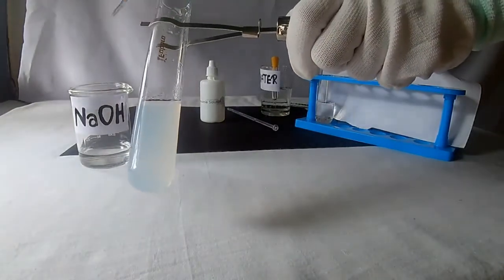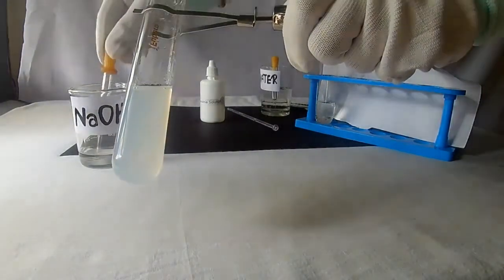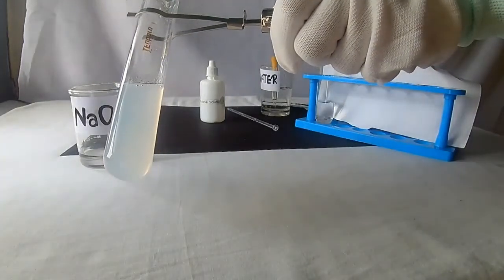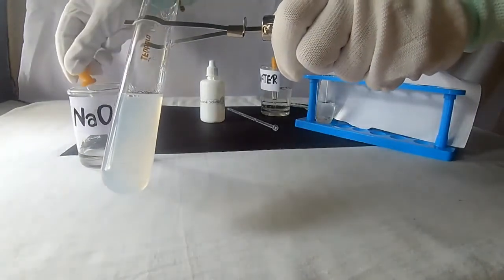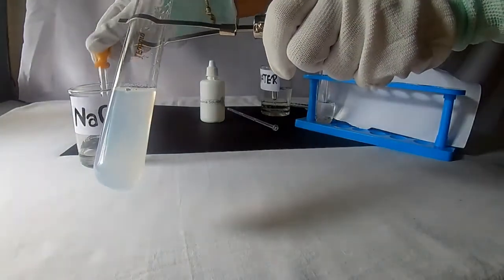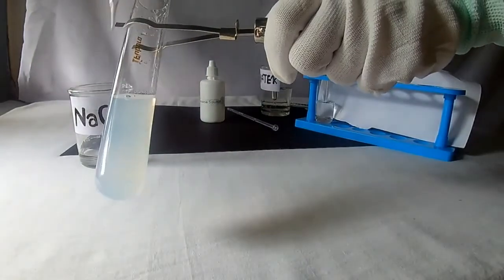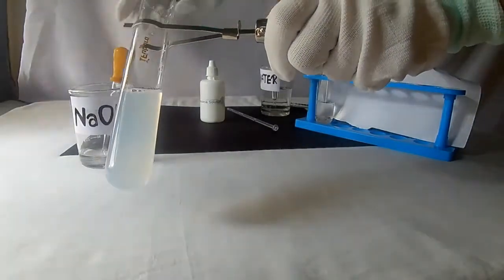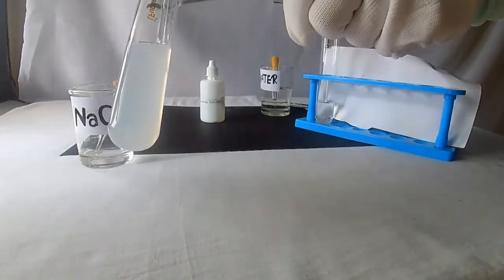If we use concentrated sodium hydroxide solution, the reaction takes place quickly. Here we are using weak sodium hydroxide, that is dilute sodium hydroxide, so it takes little time, that is the reaction takes place slowly.